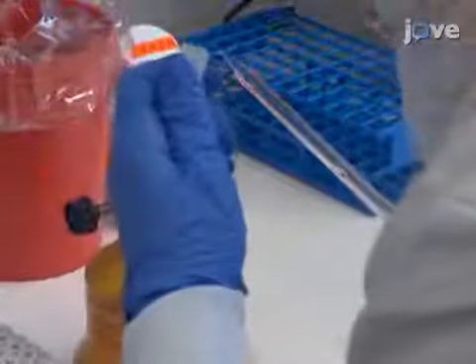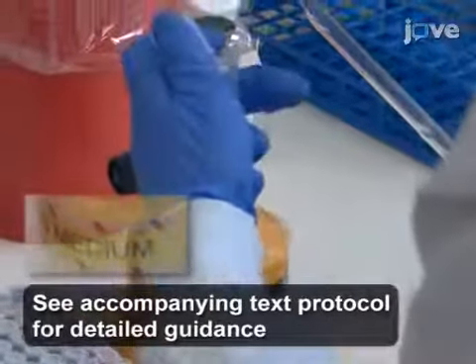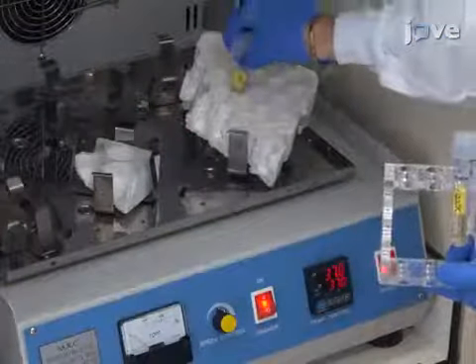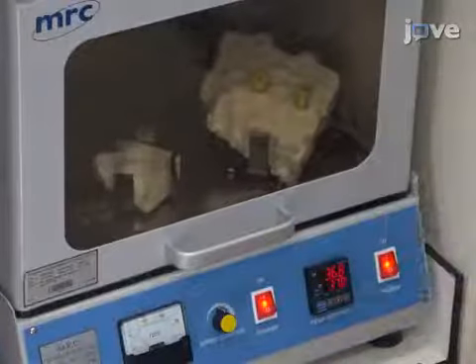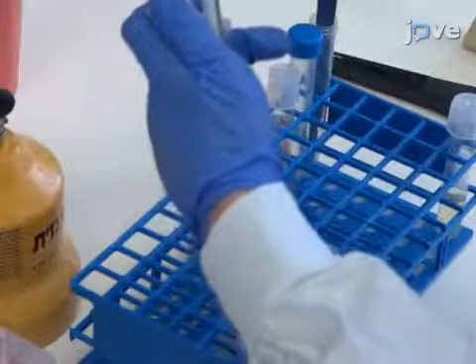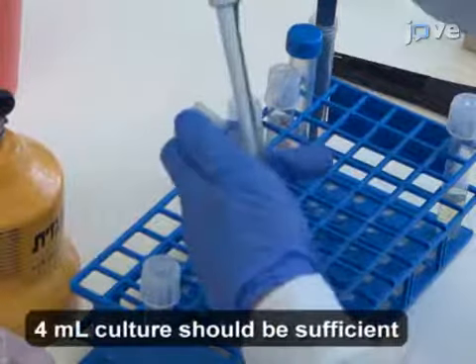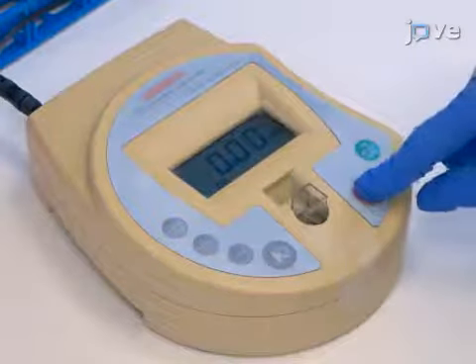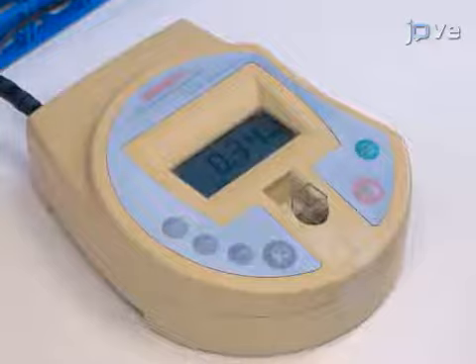To begin the protocol, grow E. coli MG1655 in LB medium overnight in an orbital shaker at 260 RPM and 37 degrees Celsius. The next day, dilute the overnight culture 1 to 100 in fresh medium and measure its optical density in a spectrophotometer up to a value of 0.2 to 0.4.